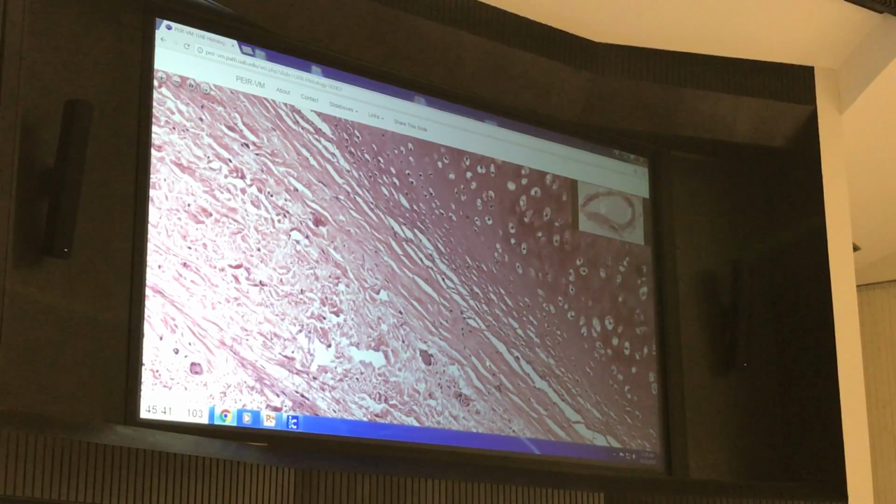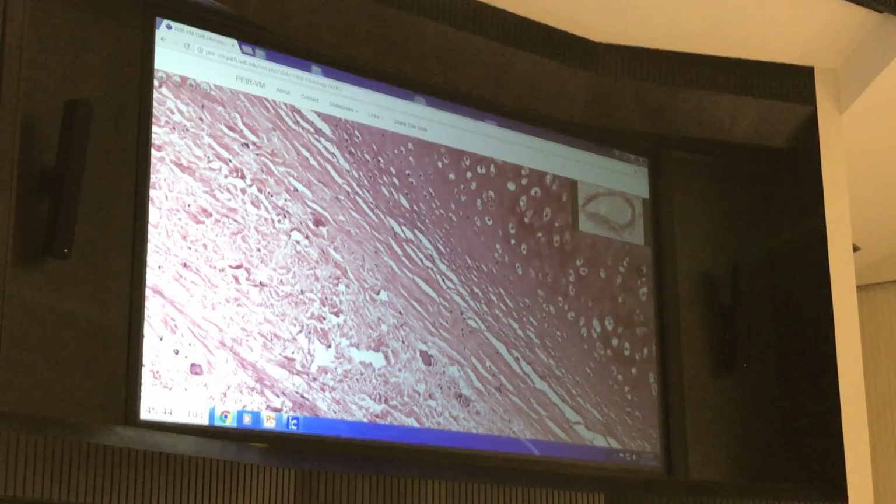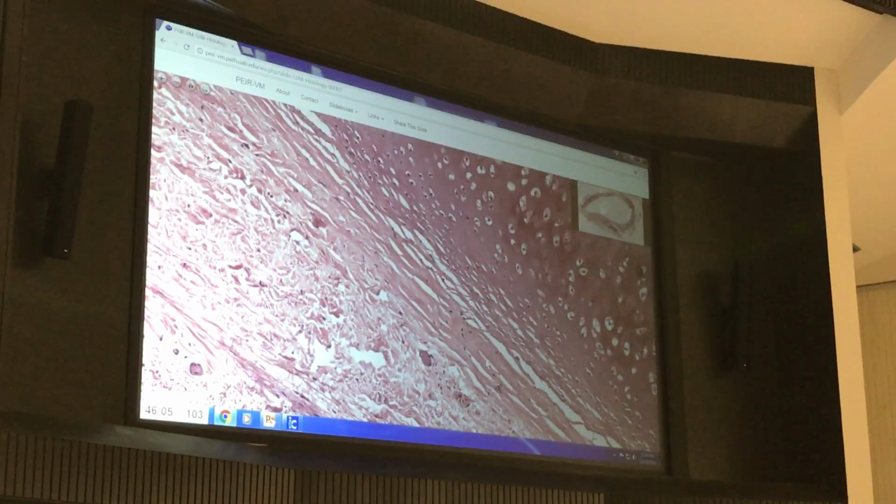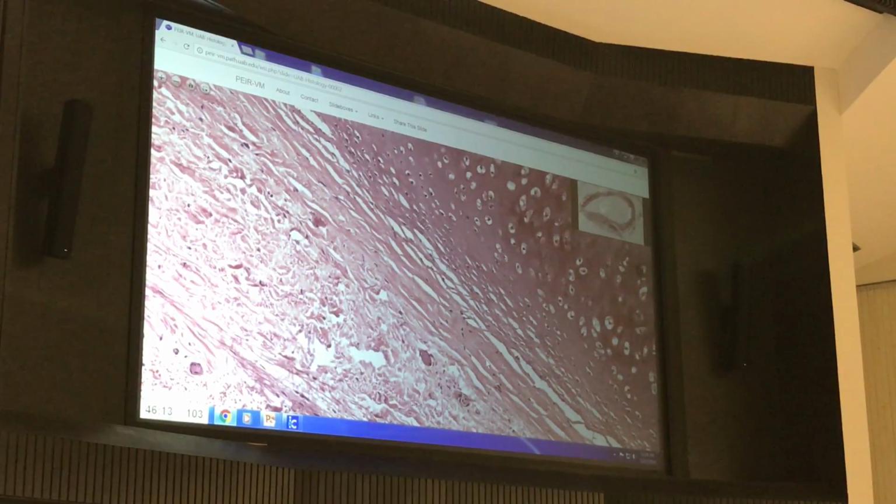Okay. So is there anything that y'all want to see again or haven't seen? We've seen all types of epithelium, right? And we've seen the major types of connective tissue, right? Dense, loose, dense regular, dense irregular. We've seen collagen, we've seen elastic fibers. We won't look at reticular fibers. You really have to know the organ, because otherwise they're going to look like elastic fibers, and you might not know where you are. So you should know your fibroblast, maybe macrophage, or plasma cell.